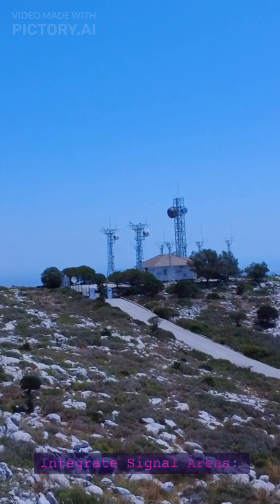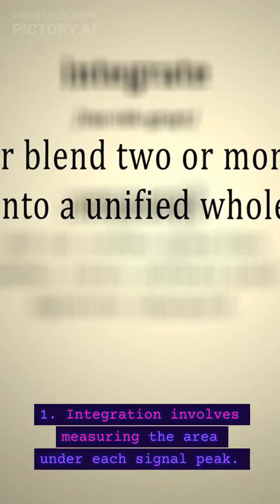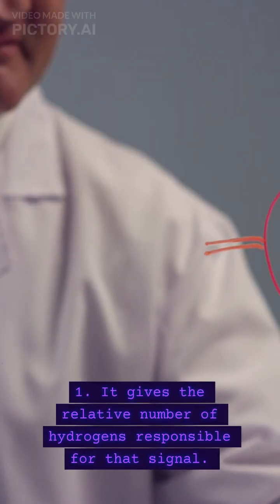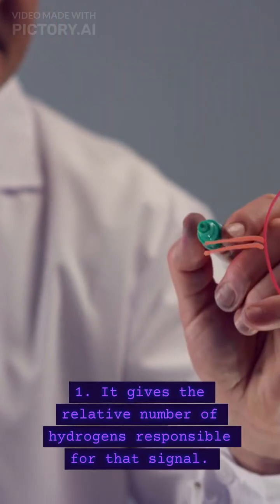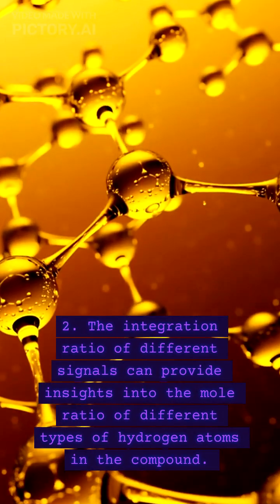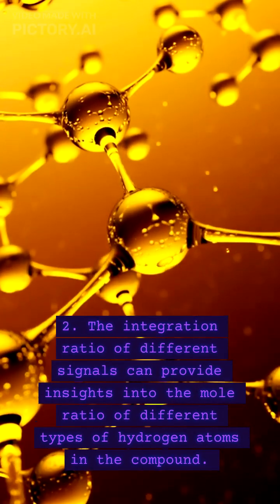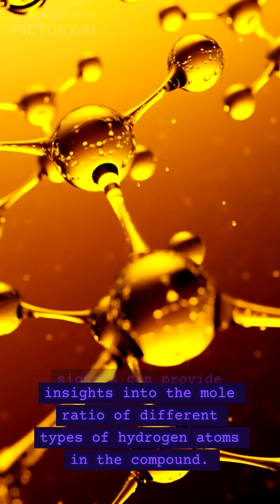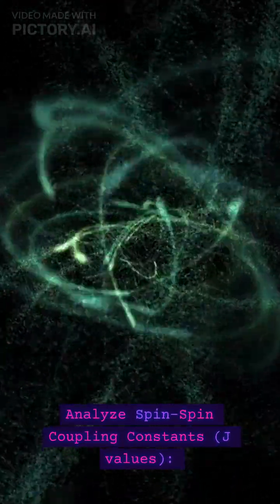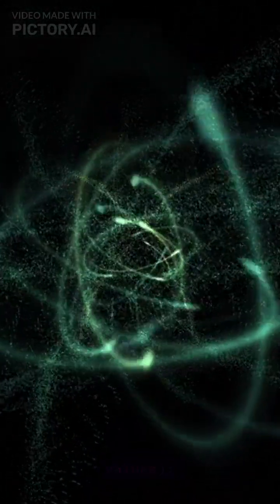Integrate signal areas. 1. Integration involves measuring the area under each signal peak. It gives the relative number of hydrogens responsible for that signal. 2. The integration ratio of different signals can provide insights into the mole ratio of different types of hydrogen atoms in the compound. Analyze spin-spin coupling constants, J values.